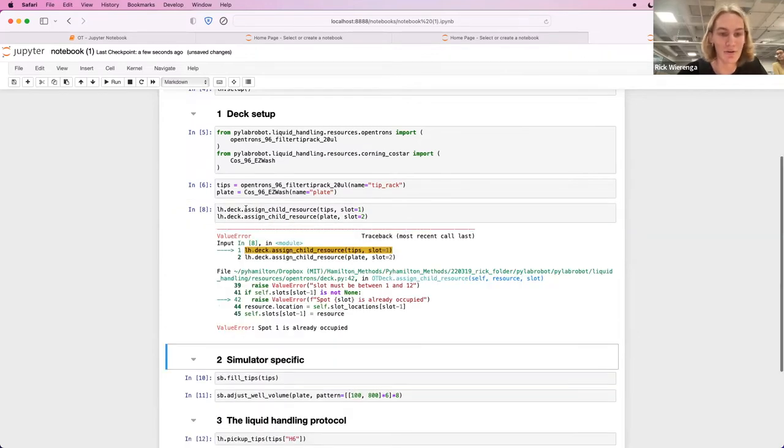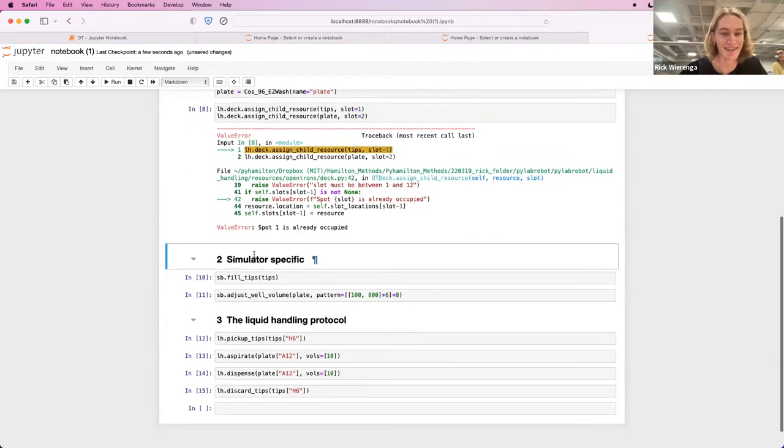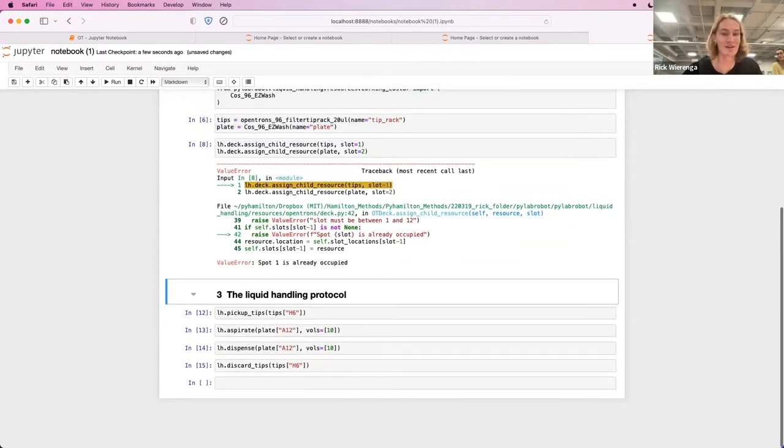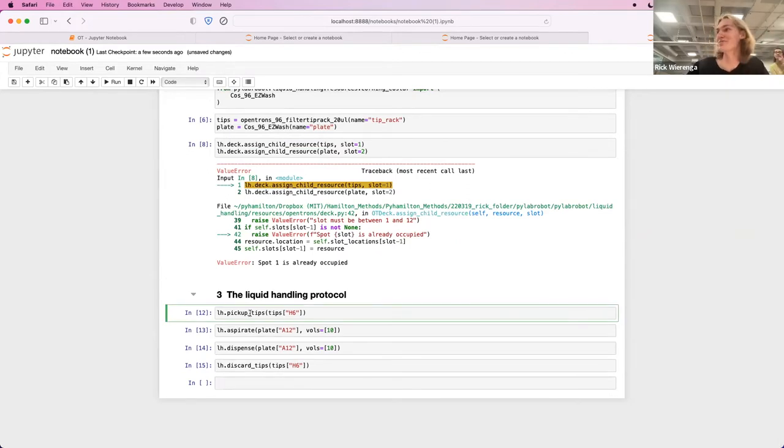Oh, I already ran that code. All right. I'm gonna remove this simulator specific code of course, but I can keep the liquid handling protocol, which is the most important part.